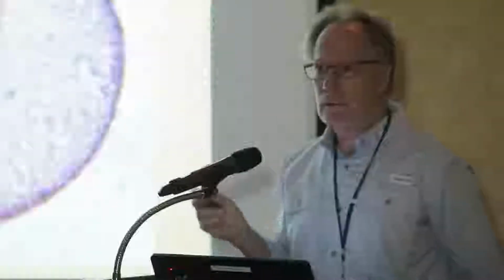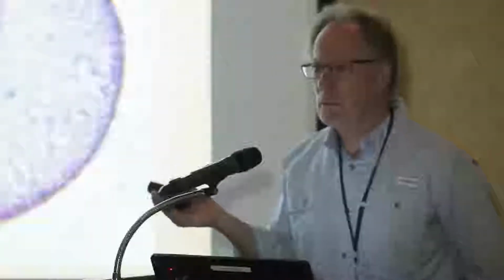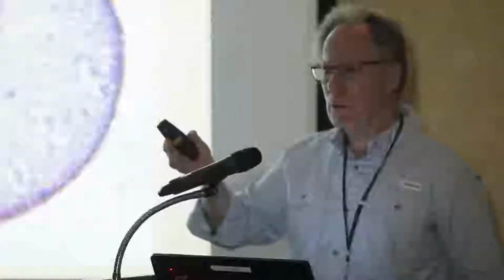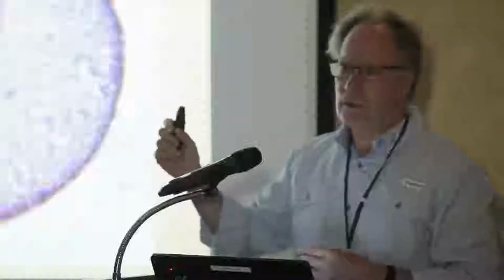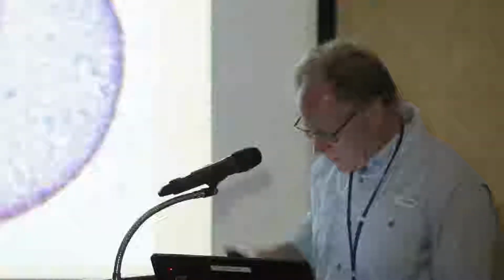I don't have the fancy system, but we had an old Sorvall microtome that was useless because it would vibrate every time you turned the handle. But the rocker arms still work and the advancements still work. So we took the thing apart and assembled the rocker arm onto the fine focus of the microscope. Now when you turn the crank on the microtome, you can focus down through the specimen at something like 30 to 40 microns. So that's basically your value call. Again, what do you want to see?